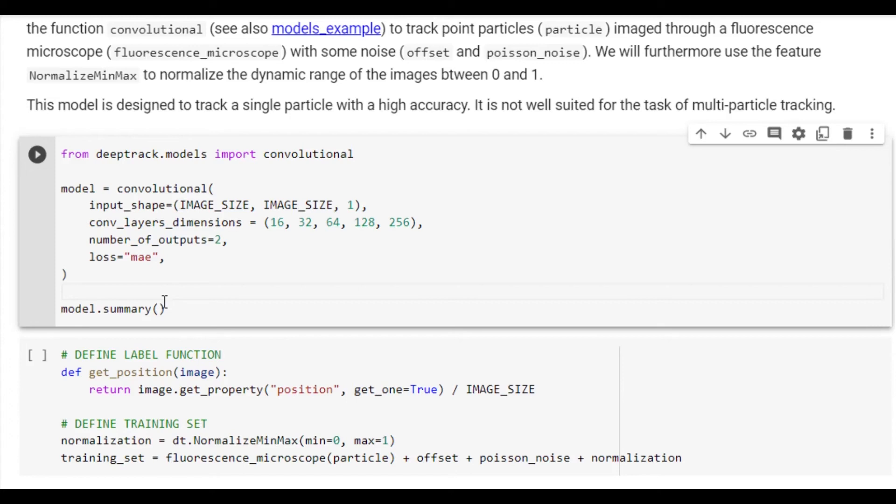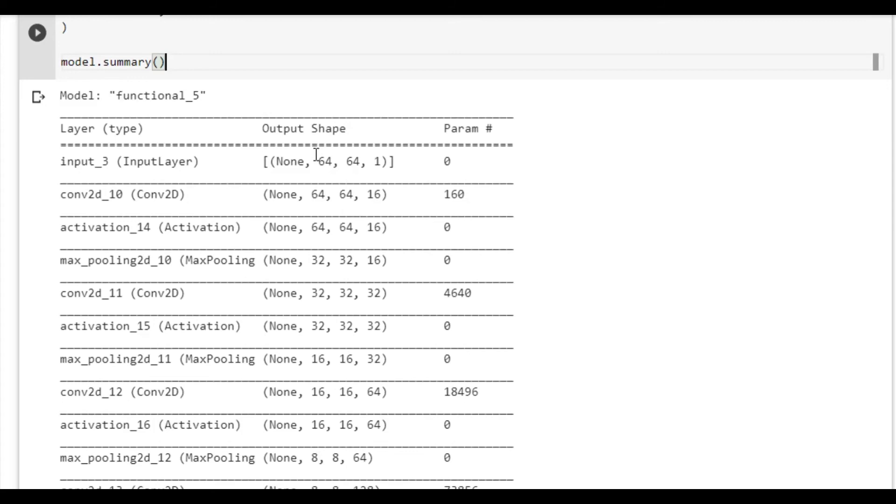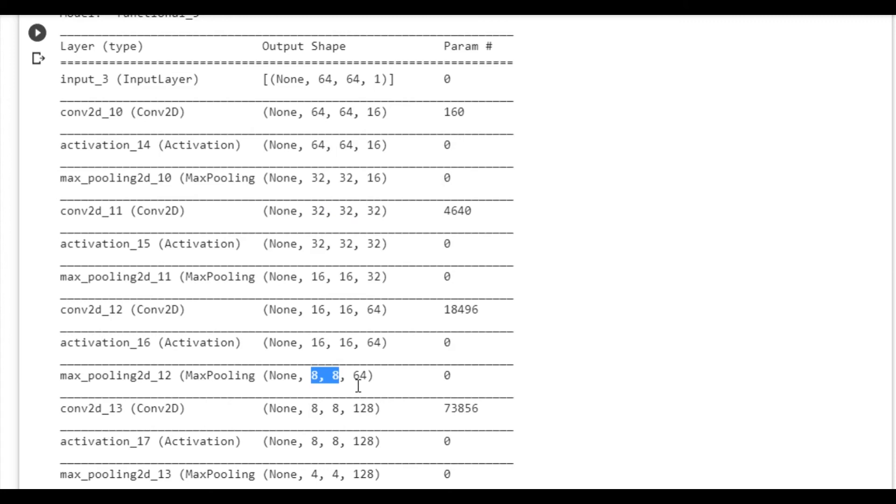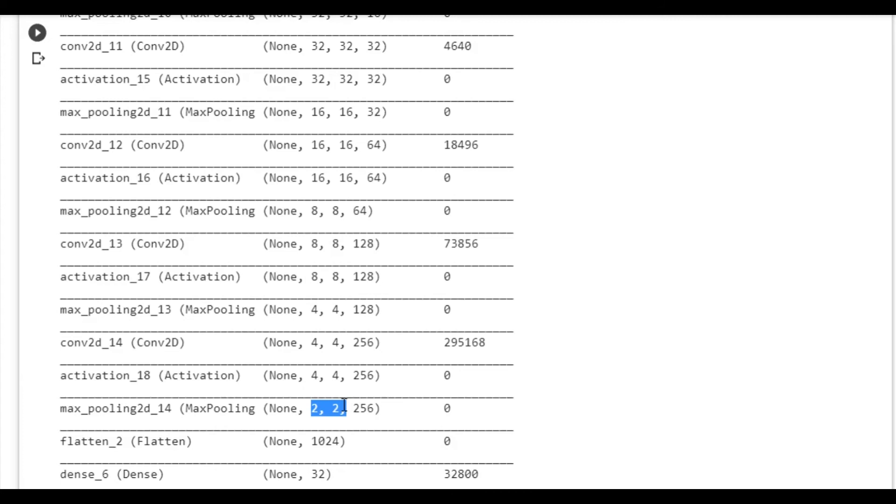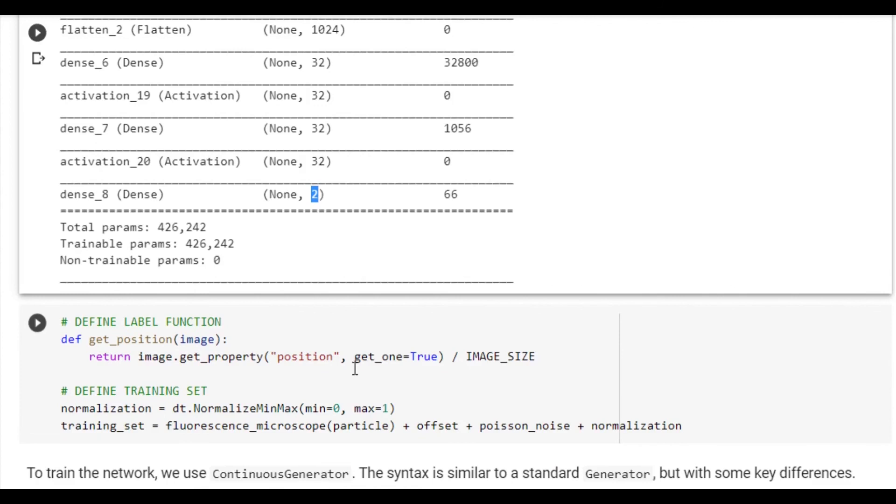We see that the network consists of convolutional layers and max pooling layers, which downsample the image from 64 x 64 down to 32 x 32, and subsequently down to 16 x 16, 8 x 8, 4 x 4, and finally 2 x 2. This tensor is flattened into a 1024 element vector, which is then passed into a dense layer, and finally a dense layer combines the results into a 2 element output.